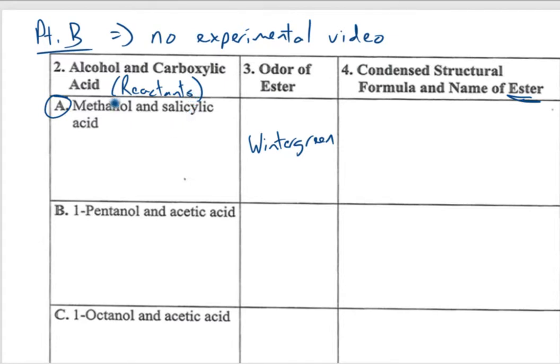And what you see there is an alcohol reacting with a carboxylic acid, which then yields this ester. Now methanol has a fairly small structure. It's the smallest alcohol. And then salicylic acid has this structure. So it's an aromatic compound, has a carboxylic acid at one position. And then at the second position over, what you can call the ortho position, you have a hydroxy group. So really you have a phenol functional group within salicylic acid.